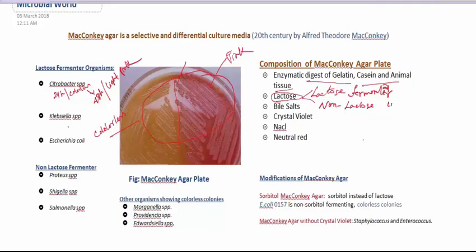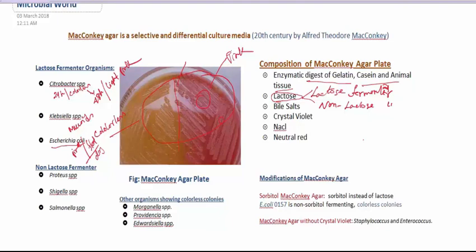For Klebsiella species, it is also a lactose fermenting bacterium and it shows mucoid colonies on MacConkey agar. It shows a rose-pink color, as Klebsiella is a mucoid organism. For E. coli on MacConkey agar, it shows good pink color, flat, dry-looking colonies. These are the colony properties of E. coli on MacConkey agar plate.